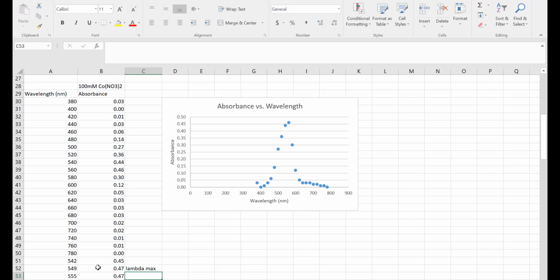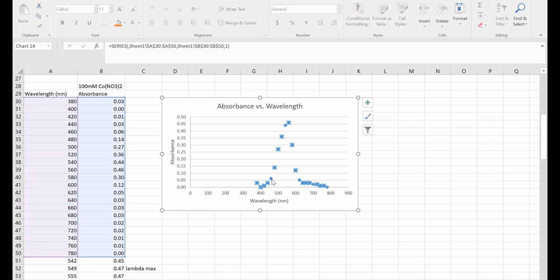Okay. So as I try to extend my graph here to include those points, again, it's just going to plot x-coordinate, y-coordinate. I know they're out of order. That's fine. I'm just going to drag, hopefully, this purple line here. And I can drag it so it knows x-coordinate, y-coordinate. It's just added a couple more points. It's just giving me a little bit more resolution there. Maybe there was one that was even higher than the 0.46 that I was looking at here. That just gives me a little more detail.